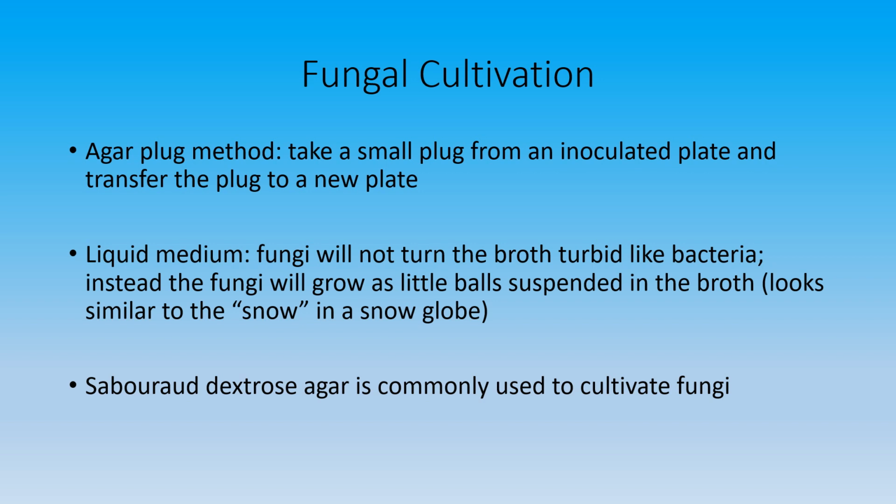There is actually an instrument that you can use. I've used it in research where it's a cork bore, and you can pull a plug, and you can get them in different diameters, from small to very large, but that way you get a consistent size. And so you can say you pulled a plug of X size when reporting, so that it's consistent, say when doing research.